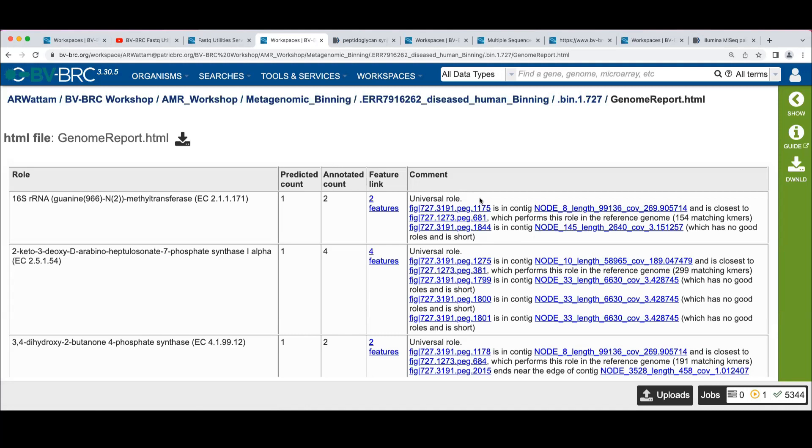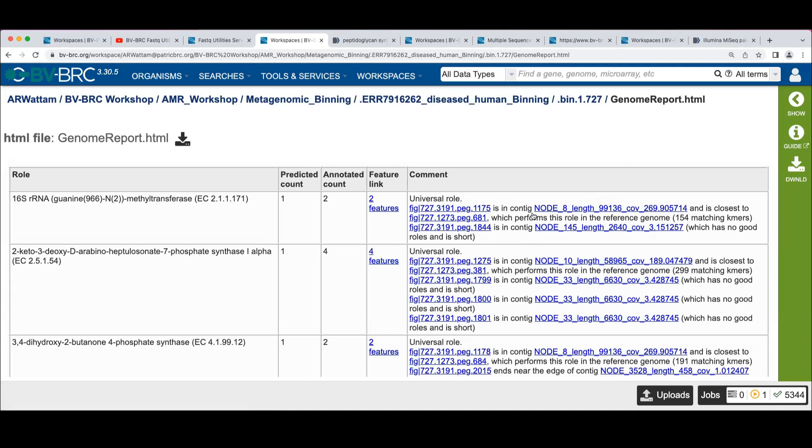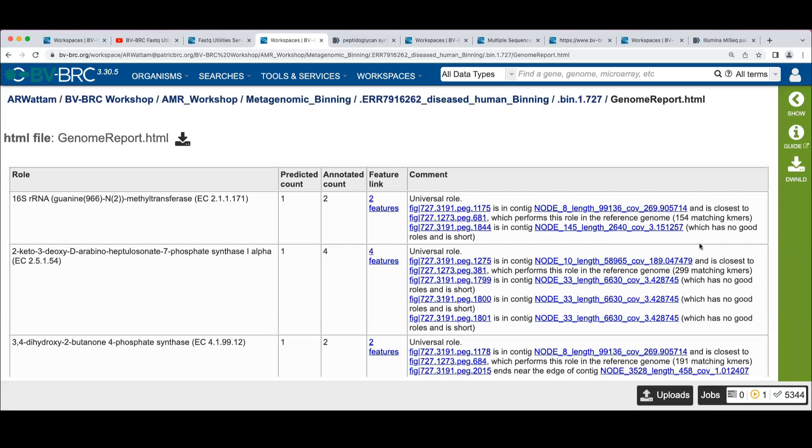So this is a universal role. One of the representatives is PEG 1175, is in this contig, and it's a close match to this other protein in the reference. The other occurrence of this guy is in a different contig, which has no good roles and is short.